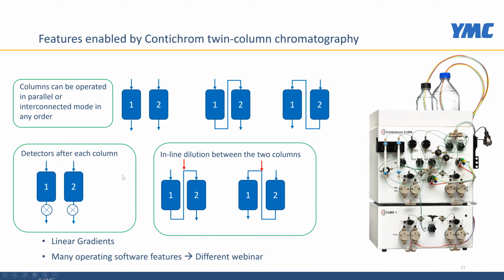The UV-based control can also be enabled through the wizard. We have two options: one front control option, where we start collecting the product based on the UV threshold, and there's also the option to do tail control, which means we start to collect behind the peak maximum when the signal has decreased by a certain percentage from this peak maximum.